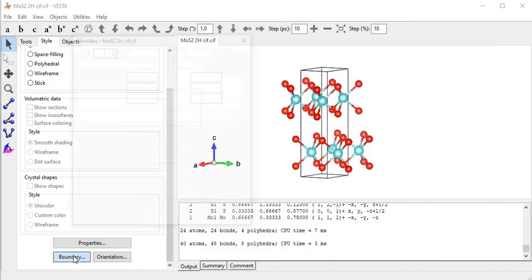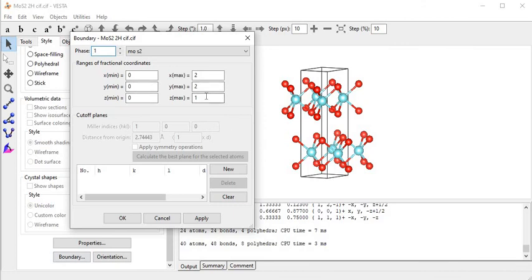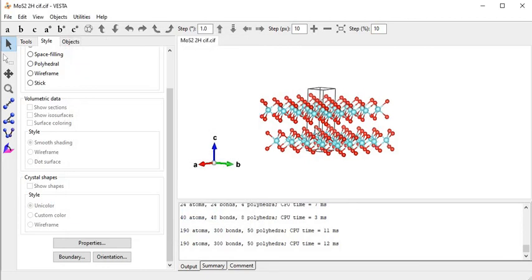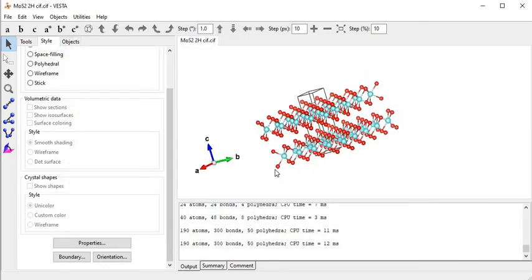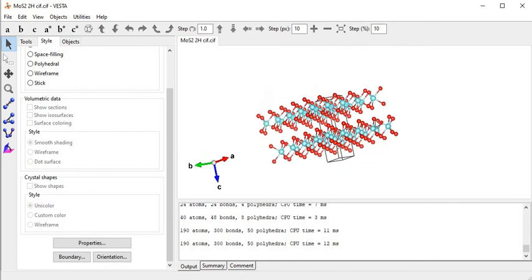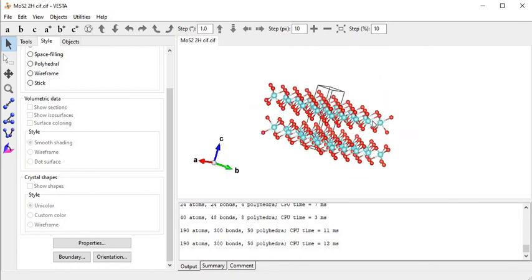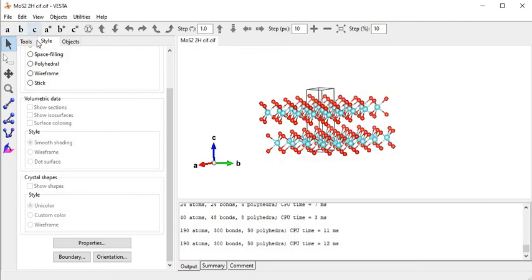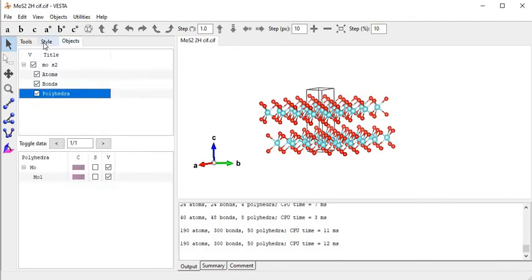Let me show one more feature - if I make the boundary five by five then apply, the crystal is extended five times in the x and y directions, and in the z-direction only two times. This gives a bilayer structure of MoS2. Now I come to the picture for observing all the unit cell views.